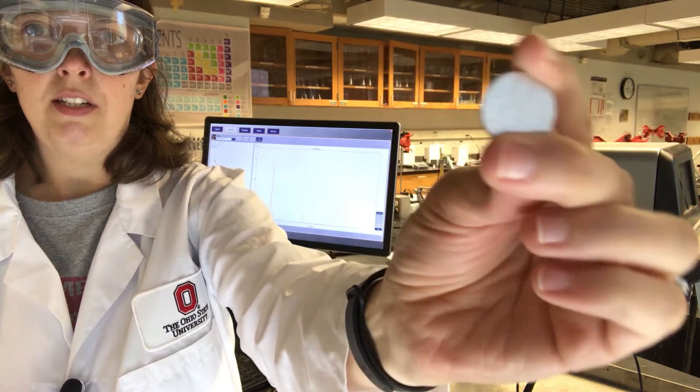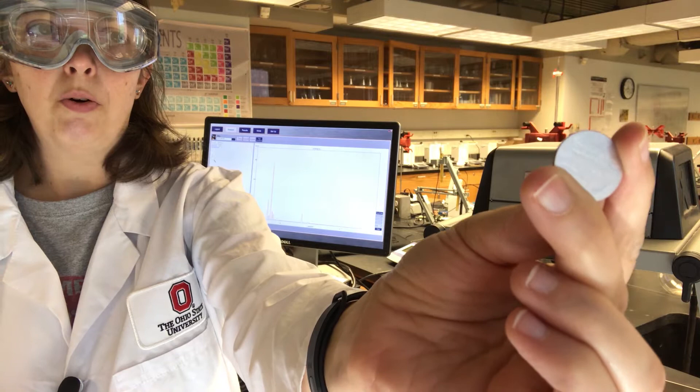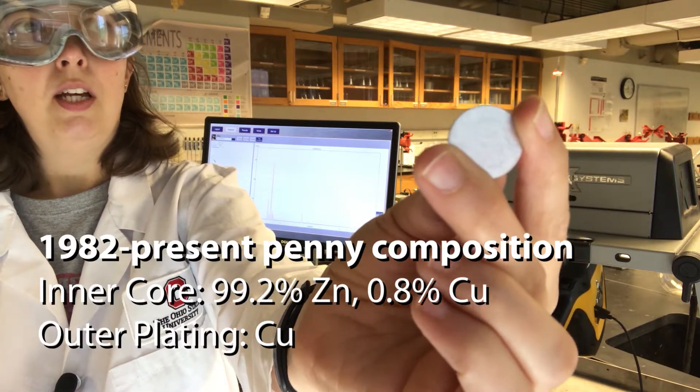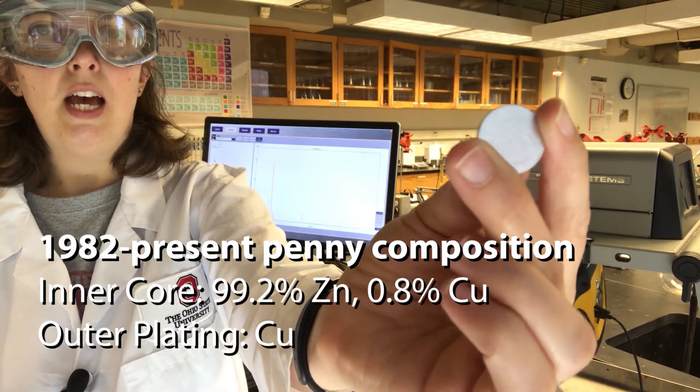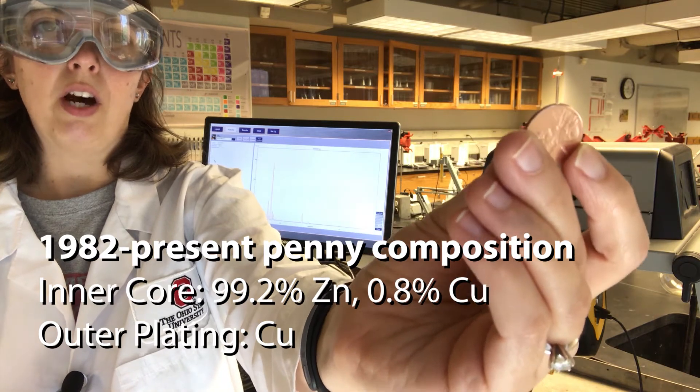The other side I've sanded down so you can see the inner core of the penny. Pennies made in 1982 and onward have this inner core. We'll see what that's made of. It's coated with copper.